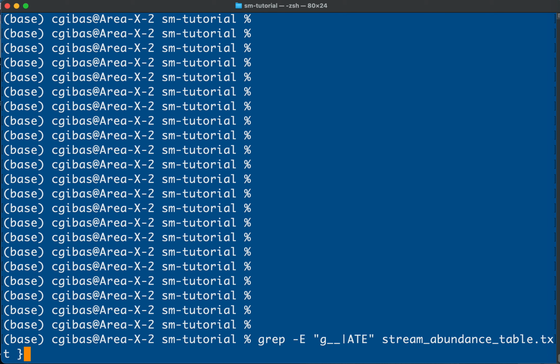And then I'm going to grep again, this time to exclude. So grep -v, and the pattern we're looking for here is s. So we want to have genus level, but not species level classification. So then after this, what we want to do is actually edit the lines on the fly so that we have more simplified names, or more simplified row names, in each of our entries. And we're going to use that little on-the-fly editing program called sed.